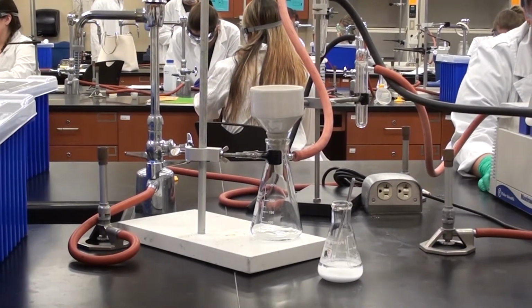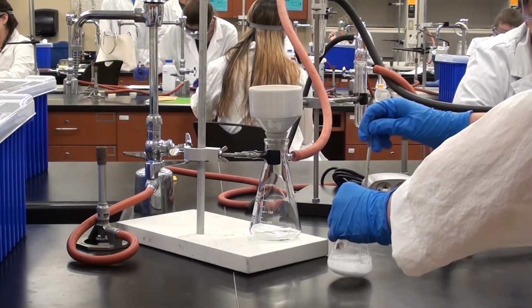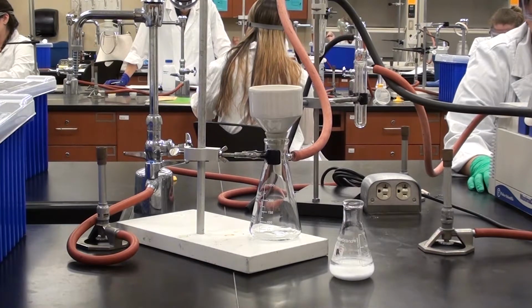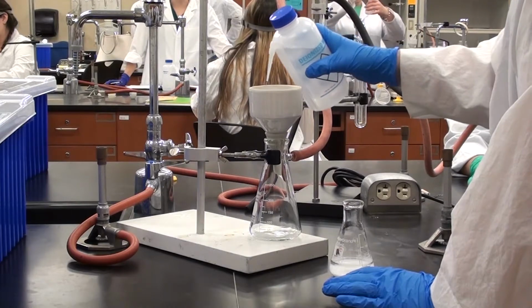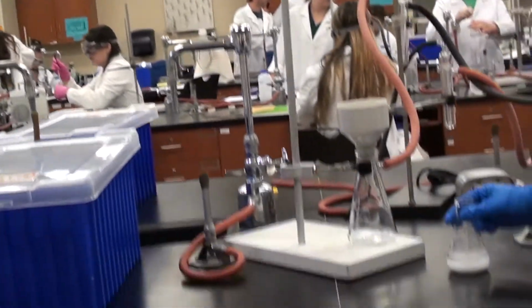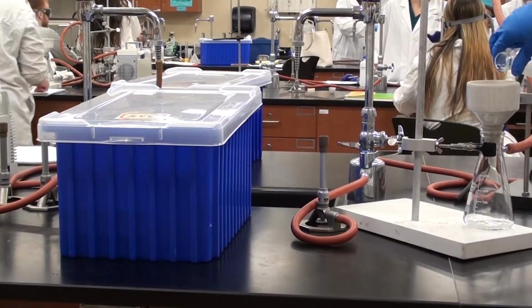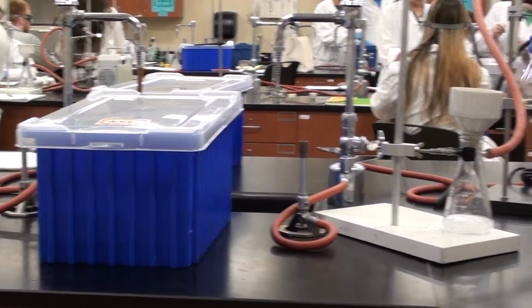Alright, go ahead Tina and turn it on please. Alright, so we're going to filter the aspirin here. Have you wet the filter paper? Not yet. Okay, let's go ahead and wet the filter paper. We're using an aqueous solution here, so water is fine to wet down the filter paper with. I'll just go ahead and show what it looks like. There we go, it's all flat down right now, and now Cassidy is going to swirl and dump. Swirl and dump. There we go. Yeah, look at that. Nice seal there.